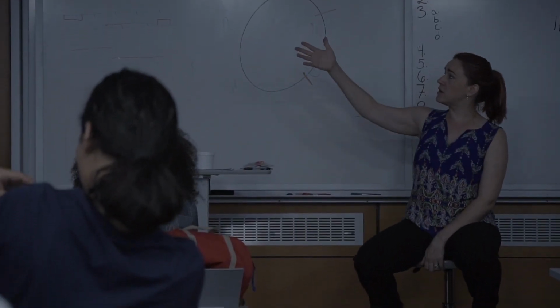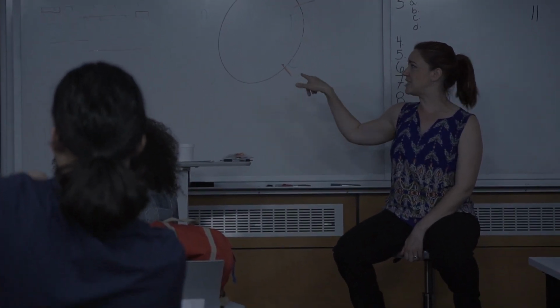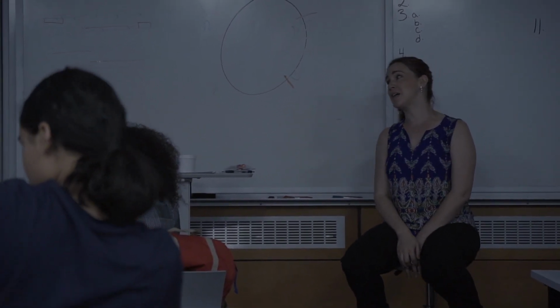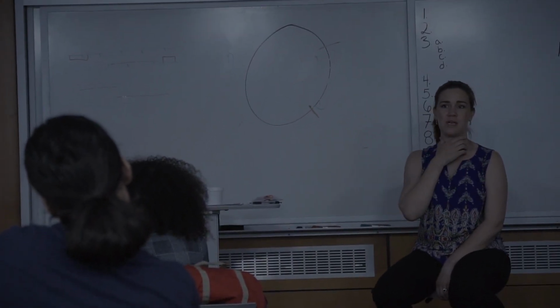And so then you could use this to assess and think, okay, I'm ending up with a band that's too short, and you can figure out what size it is and kind of guess, okay, this might be coming from the elongation step. So the next time we run that program, we're going to increase that by a minute and see if that helps us get that full DNA.